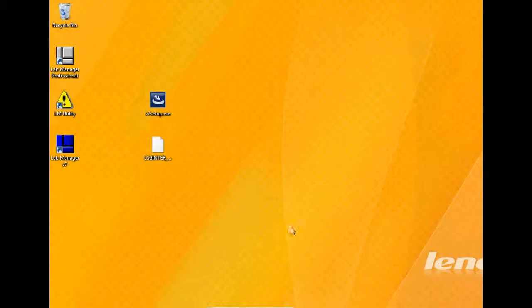Now, when you do go into the software, because you won't have the server tools, you need to make sure the server is set up properly. And with the server, you'll need to know what the server name is. So when you double click on your Lab Manager, it's going to take a second or so. It will pop up with a box saying it can't find the server. It doesn't know what it's looking for. And so we're just waiting for that box to pop up.